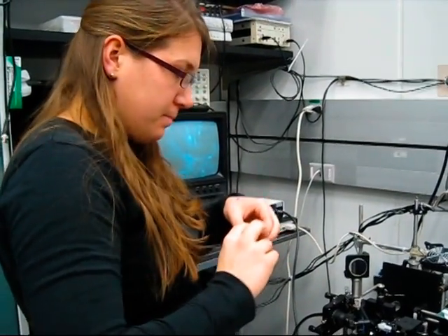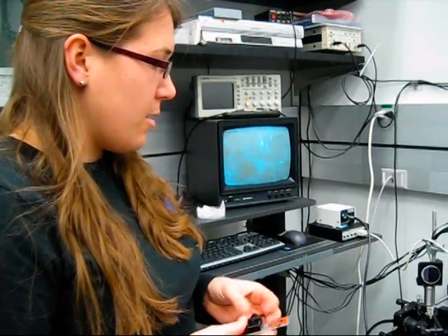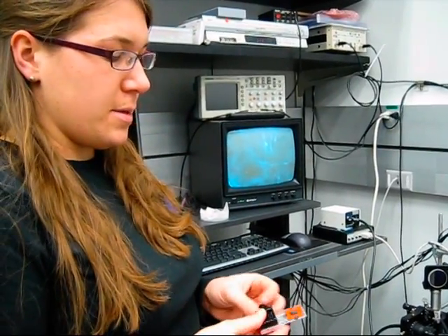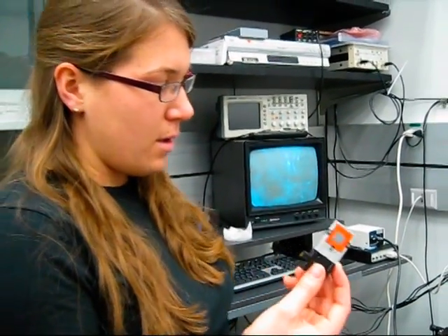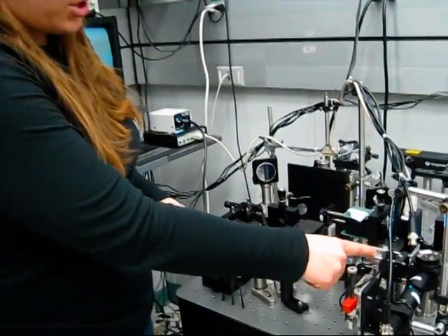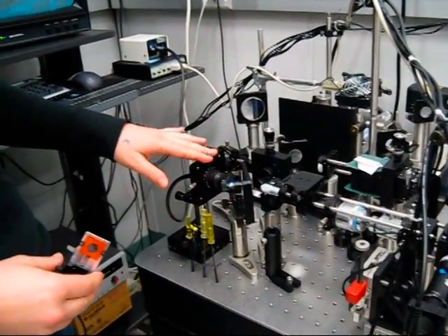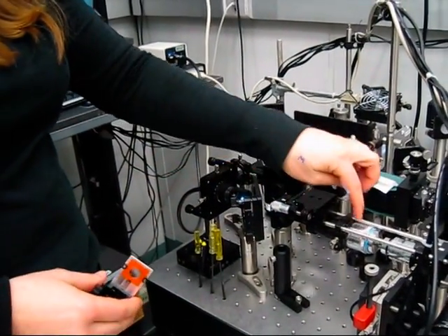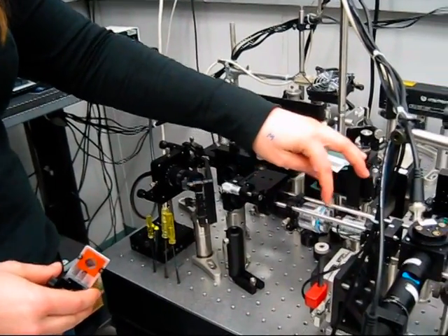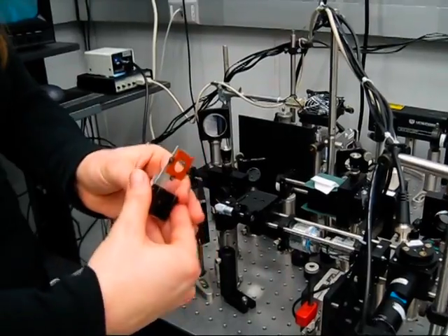This is my homemade microscope setup. This is my sample chamber that fits onto this rail and slides up between the objective and condenser lens of the microscope. This is the light source that is gathered or collected by this microscope objective and focused into the trapping plane, which is also the imaging plane.